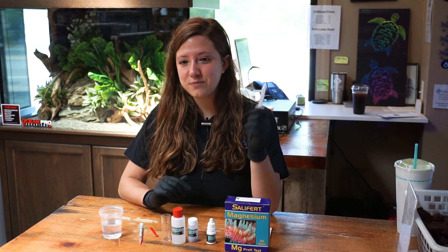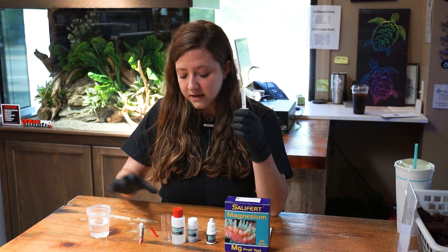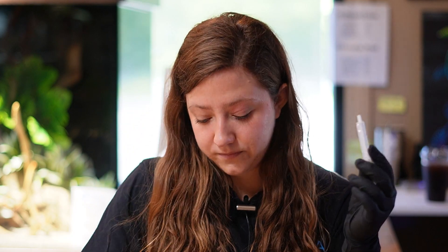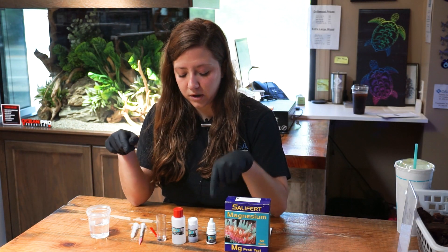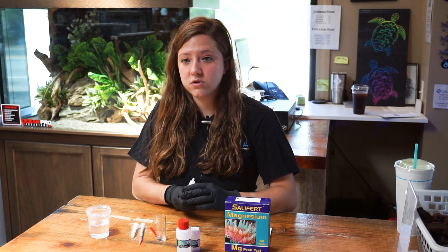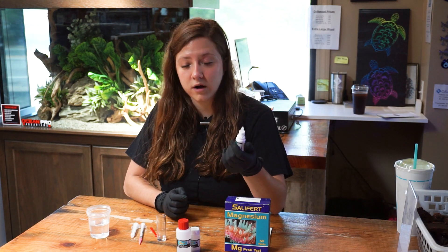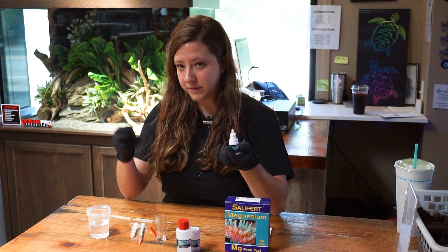The first step is to take your 2-milliliter syringe and add 2 milliliters of the water you are testing into the little test vial. The next step is adding all the reagents — they are numbered one, two, and three, so you're just going to go through and start with number one. For reagent one, you are going to add five drops. When adding any drops, you want to make sure you hold the bottle completely upside down so the drops are uniform in size.